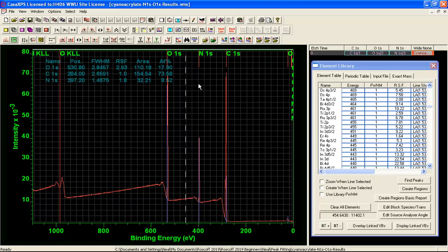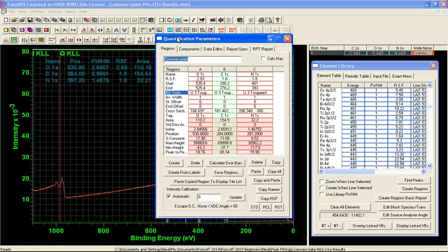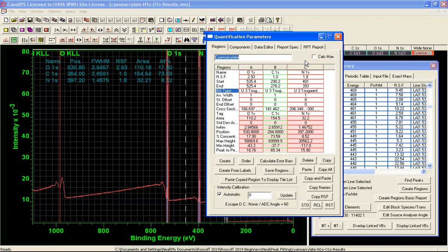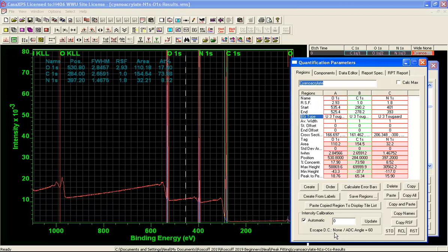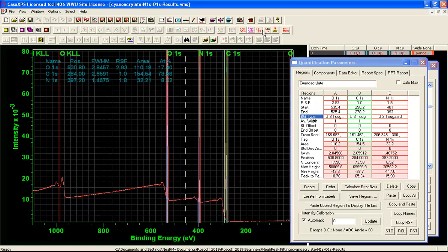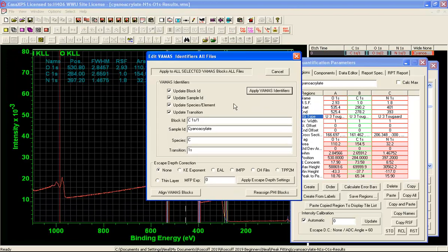So if we use Schofield cross-sections we must also verify that the regions are being corrected for an escape depth correction. So we are making an assumption that we have a bulk material here and this seems to be a reasonable assumption. So what we are going to do is change from an escape depth correction of none to an escape depth correction of effective attenuation length.